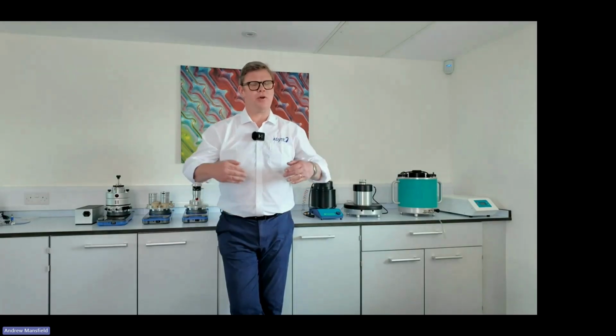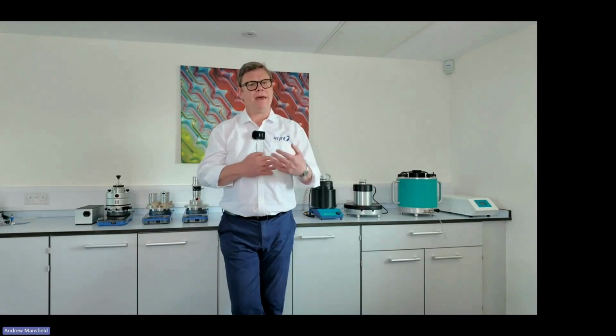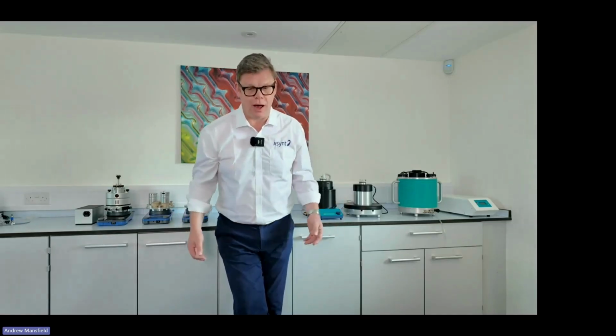Today we're going to be giving a brief introduction into photochemistry and really going to focus on how modern equipment, modern photochemistry apparatus, has made the area of photochemistry a lot more efficient and a lot more accessible to chemists in modern laboratories. It should be running about 35-40 minutes or so.